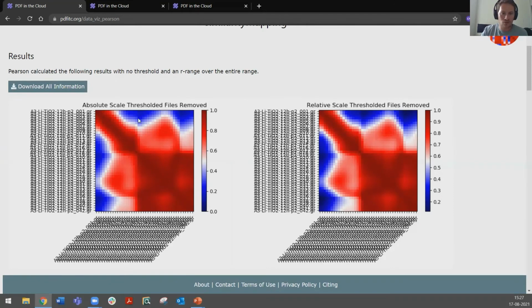In this plot, you also see some sort of a discontinuity. However, let's consider this block here, which is after the deep discharge, or after the order-disorder transition. From that point, you can see that all the PDFs resemble each other to a significant extent, as we also observed in the overview plot, right? However, it still seems like something is going on during the following charge, discharge, and charge.